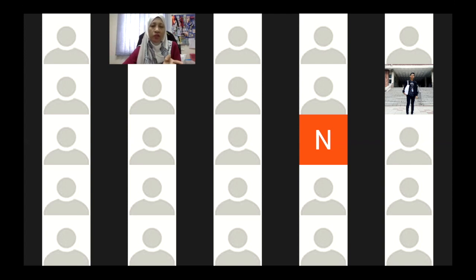So the first video is only to show how you can inject your sample. But please bear in mind, before you inject your sample, usually we flush the GC, the column, with purified water to make sure there is nothing left, I mean the remaining compound from the previous analysis.